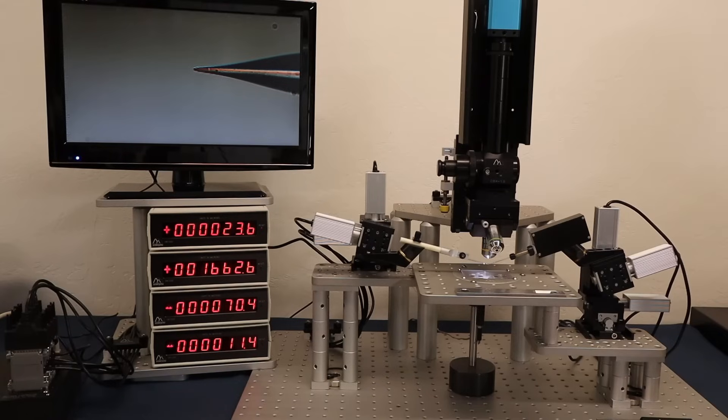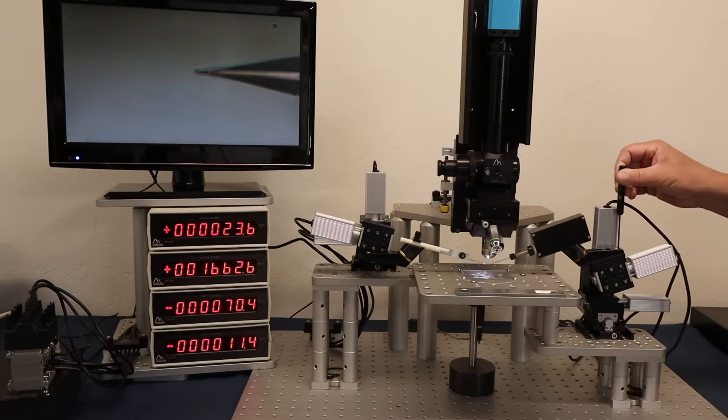The four-axis manipulator has a tilt stage that is easily rotated to the angle needed for your setup. A hex key is provided to unlock and re-lock the position of that tilt stage.